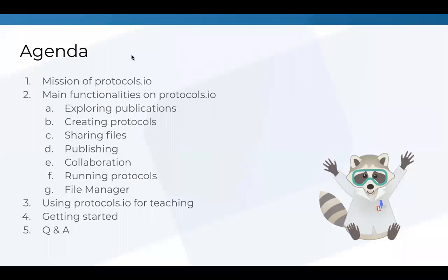The agenda for today is, first I'm going to tell you what our mission of Protocols.io is, and then I'm going to walk you very briefly through the main functionalities on Protocols.io, which includes exploring publications, creating your own protocols, sharing files with others, publishing, how you collaborate on Protocols.io, running protocols, and the file manager.